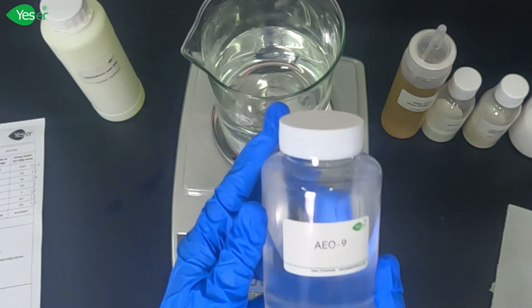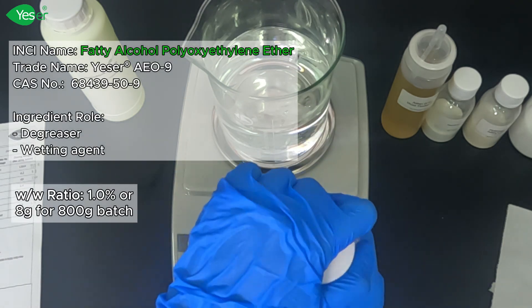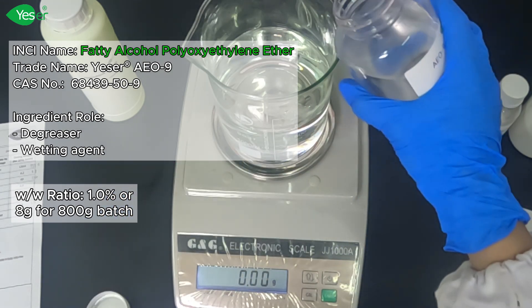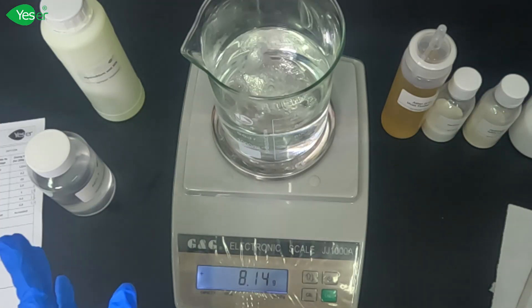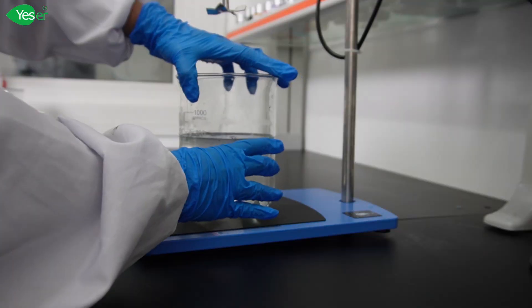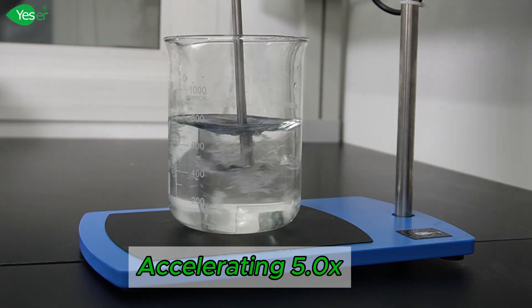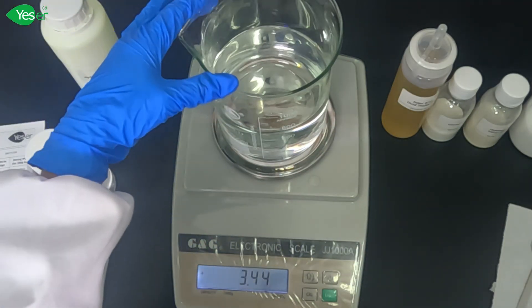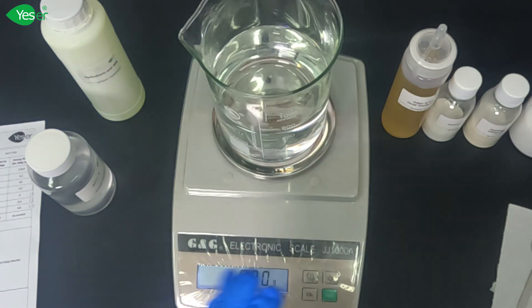Then we will add our surfactant, which is Ae09. Weigh 8 grams of this or 1% for our formula. Now let's stir this in our overhead mixer until it is fully dissolved. Now that we have fully dissolved our Ae09, we will now divide this batch into 4 and then add our thickeners.